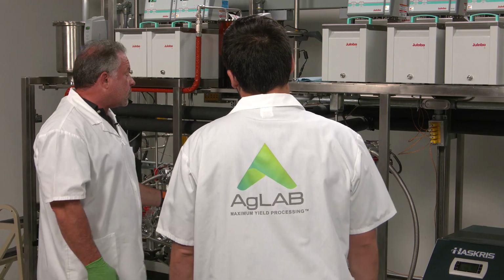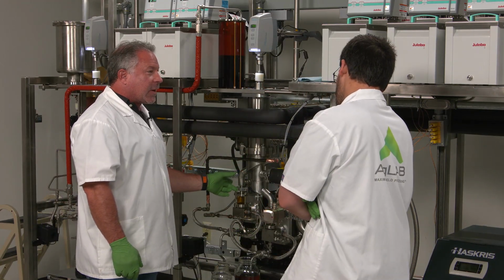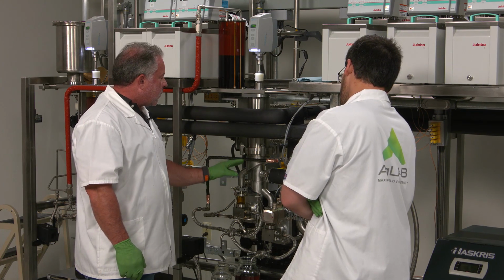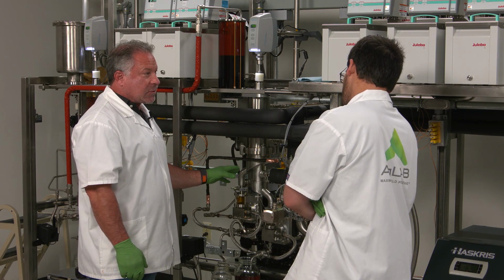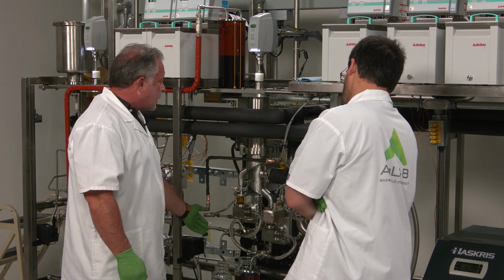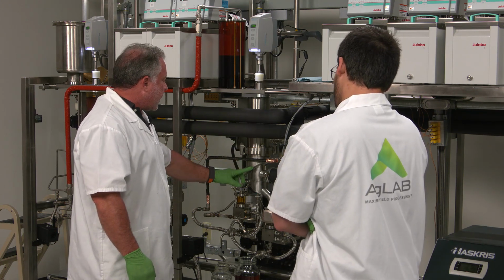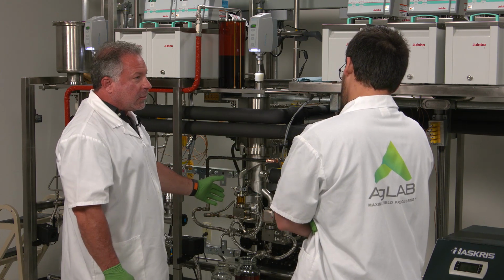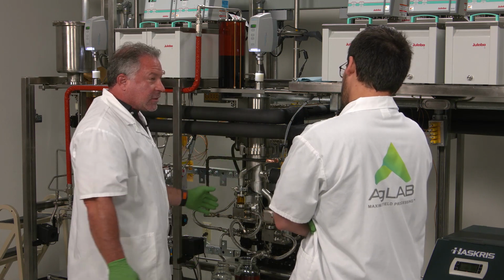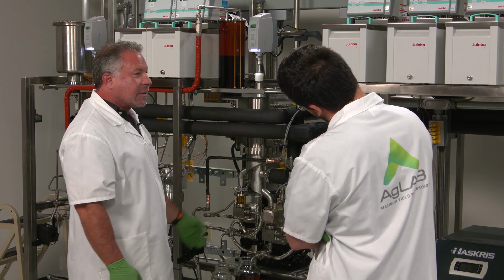One of the things that we can use too in this situation is that the residue is a very important area to look at, and the temperature of your residue zone changes what you can bring into the side or recondense into this area. So if your residue is the same as your condenser, you're only going to get a 50-50 split, and you're going to condense cannabinoids in here and here because they're the same temperature.